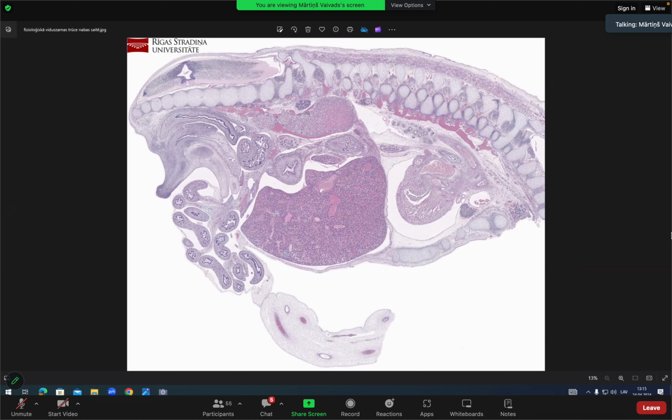I will put the slide also on the microscope. This slide is typically shown on the lowest magnification. I will briefly put this on the microscope and then I will switch between the microscope and the pictures. So, yes?